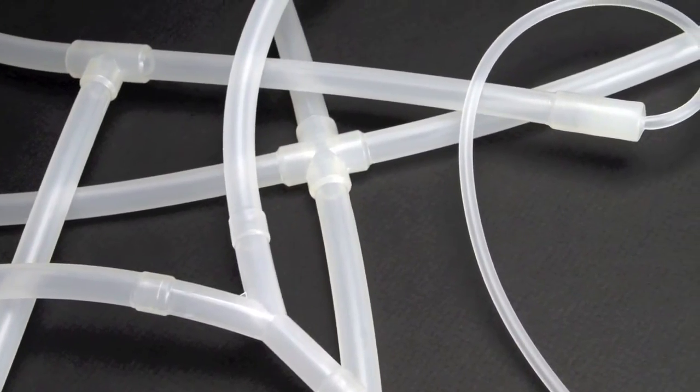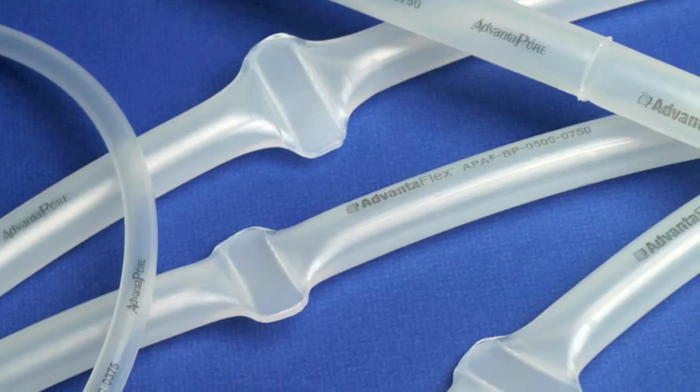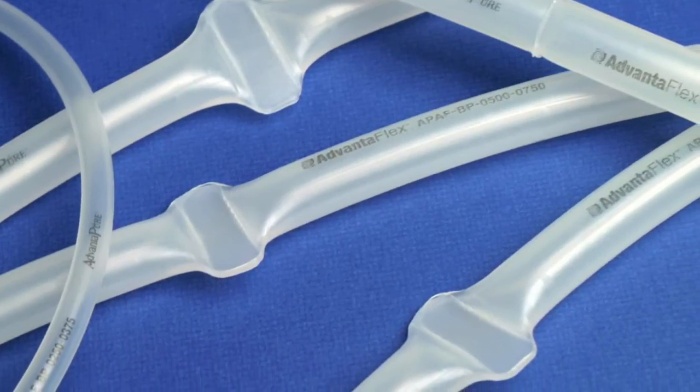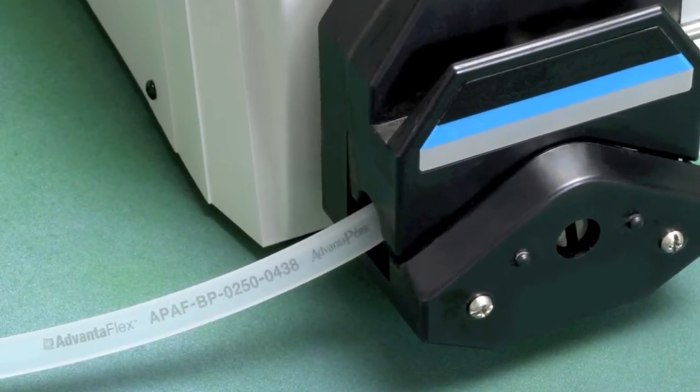Four of Advantiflex's key features are its ability to be molded into connections and container closures, its capabilities for aseptic welding and sealing, and its performance in peristaltic pumps. Let's take a quick look at each feature.